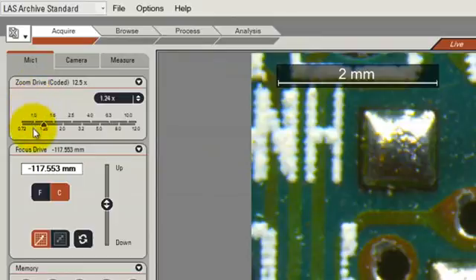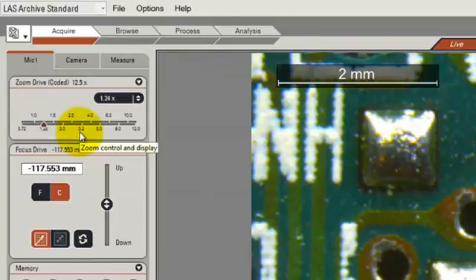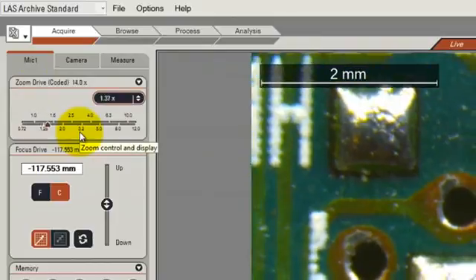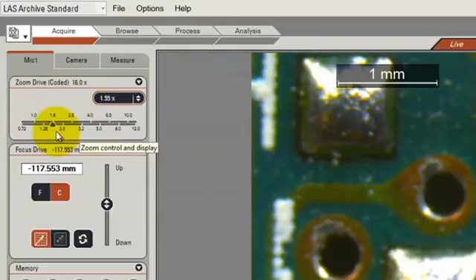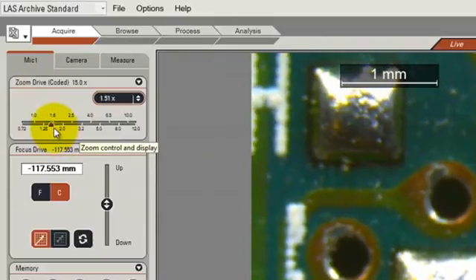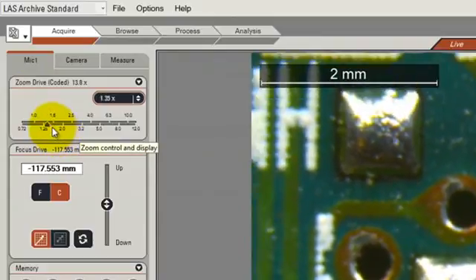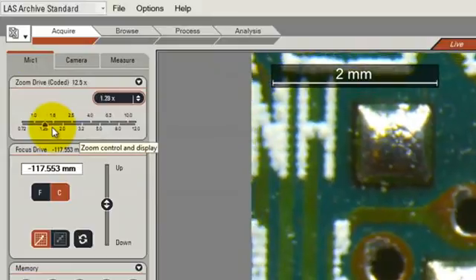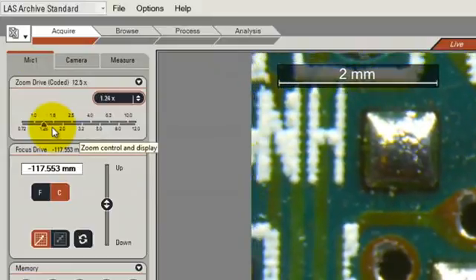So if we look at the zoom control, as we adjust the zoom on the microscope, then we can see that the zoom level is changing on the LES control panel.